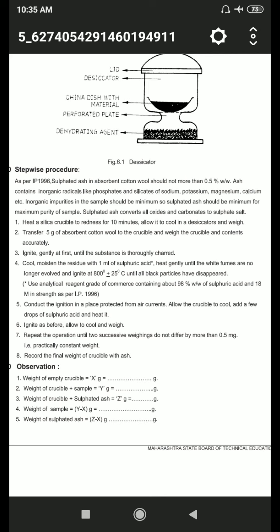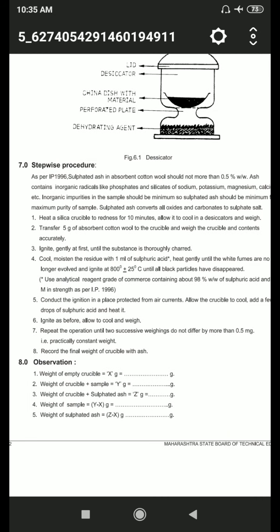Record the final weight of the crucible with ash. For the observation table: X is the weight of the empty crucible, Y is the weight of the crucible with sample, and Z is the weight of the crucible with sulfated ash. The weight of the sample is Y minus X, and the weight of the sulfated ash is Z minus X.